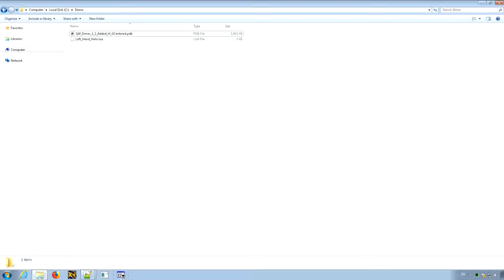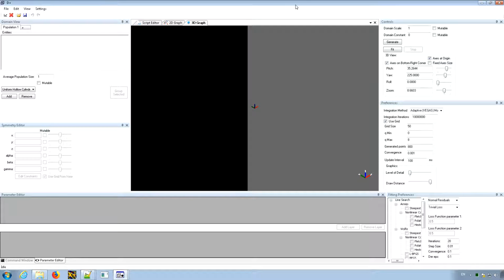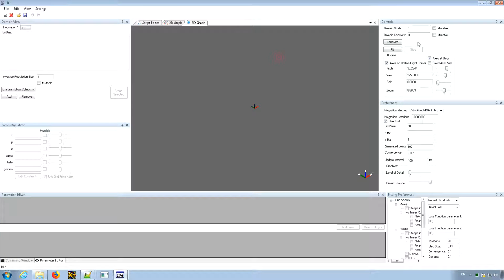In this tutorial, we shall show you how to compute the scattering curve from a complex protein structure built from a single PDB subunit in a symmetry. More specifically, we shall compute the scattering curve from a microtubule. First, we will show you how to use scripted symmetry.